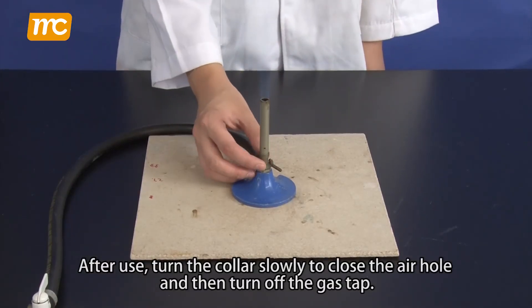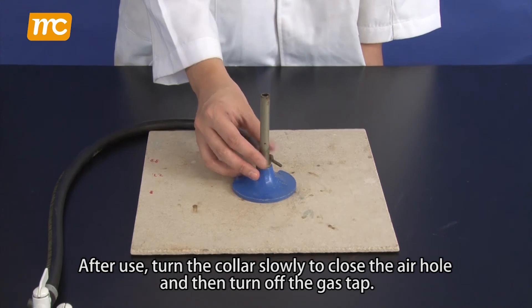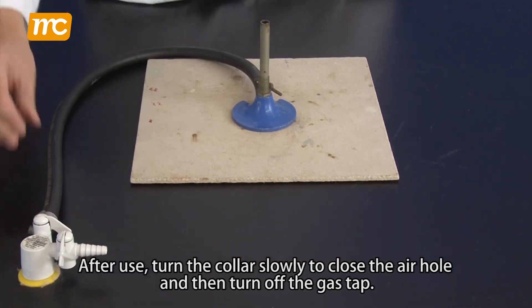After use, turn the collar slowly to close the air hole, then turn off the gas tap.